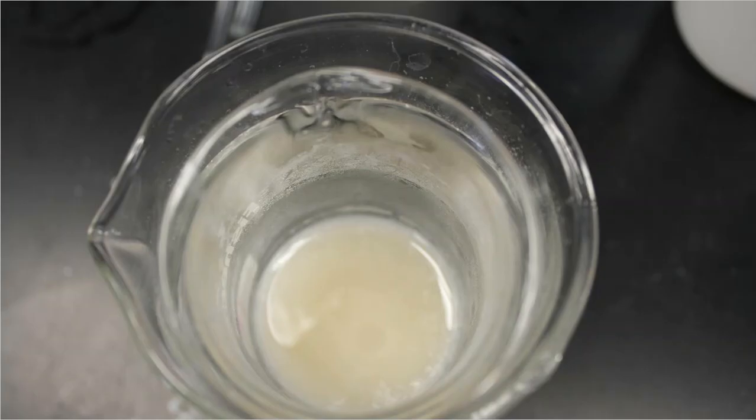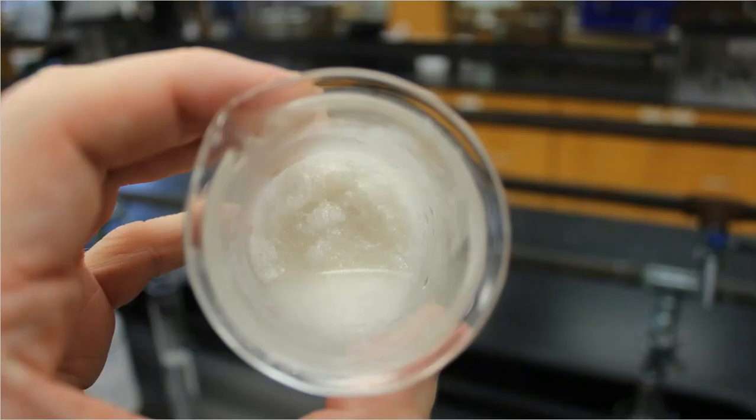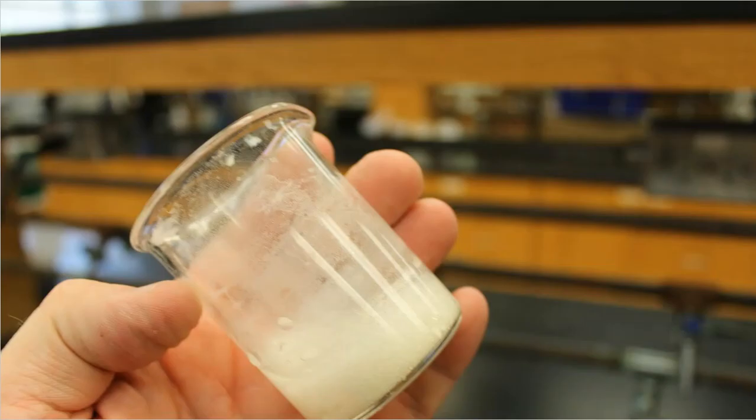From the top down, this is what that precipitate, that crystal, began to look like. And the ice bath happened from 1:22 p.m. to 1:29 p.m. It did not take long for that either. I took it out, and this is what I saw. It's what you see now. To the side, there we go. Make your observations.